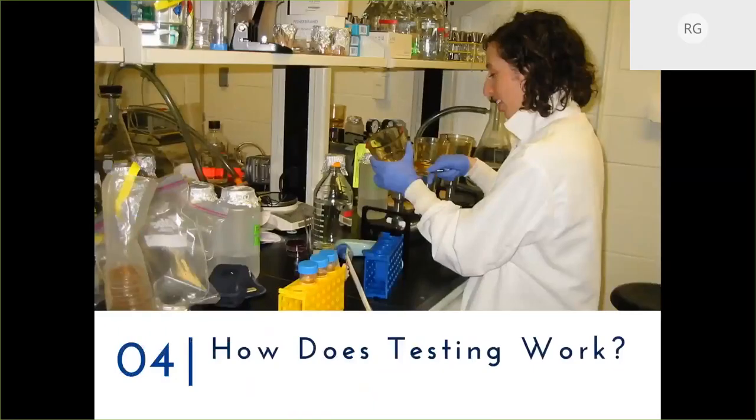So now we've talked about why it's important to test your water, the type of things that you might want to test, and how to collect that water sample. But then how does the testing actually work?